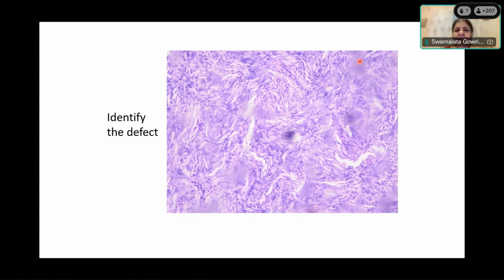Yeah? People said deparaffinization, that's possible. Actually, here's a problem. It's mainly due to your cover slipping. Either the DPX is thick and thin, so you get this. But this, in fact, was when you use an automated cover slipper. Sometimes it picks up the cover slip and it drops it on the slide. And sometimes it will pick up two cover slips. And by mistake, even your technician, when they pick up a cover slip, if they pick up two cover slips and they put it like that, it's basically a defect in cover slipping. So two cover slips at a time. And so that has made the slide like this. And easiest way, like I said, is just hold it against the light and it'll be opaque.